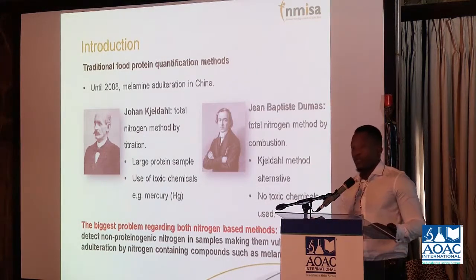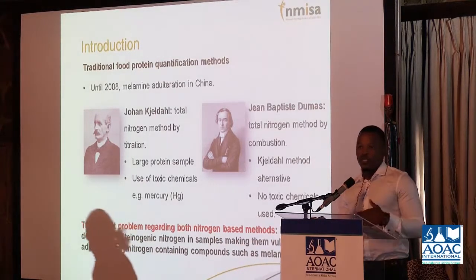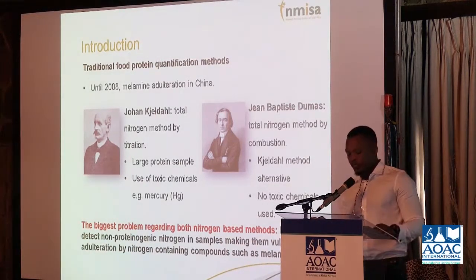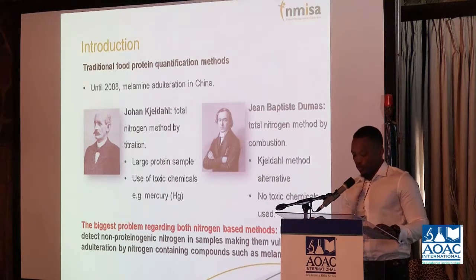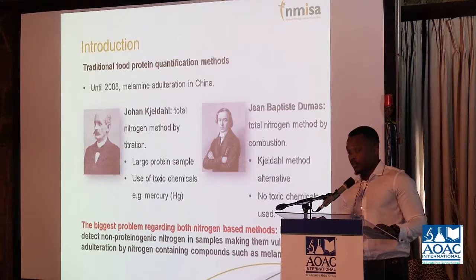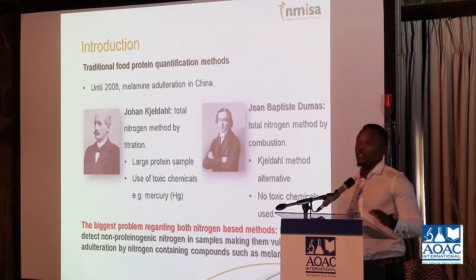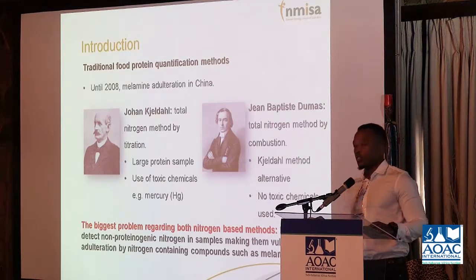But then the Dumas method was a better alternative because it only used combustion, so you don't need to use chemicals in order to quantify the protein. But the shortcoming of both of these methods was that they are both based on total nitrogen content in the sample.